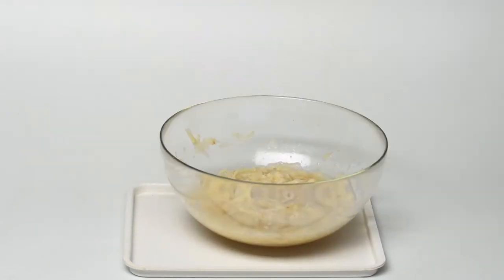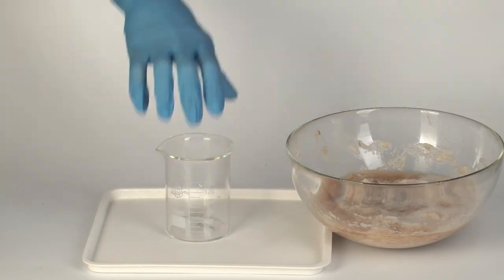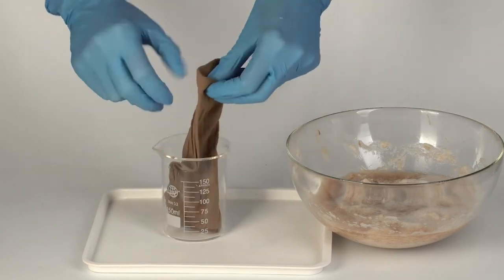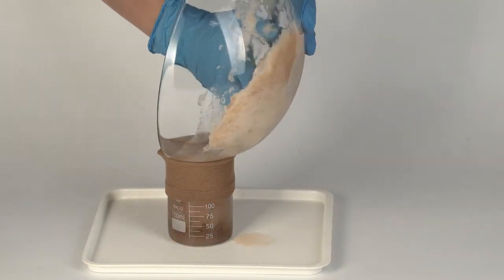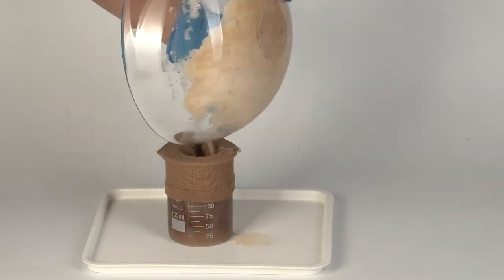Slip the sock onto the beaker. It will serve as a filter for potato cuttings. Carefully pour all the liquid from the bowl into the sock. Then remove the sock and squeeze all the liquid in it into the beaker.